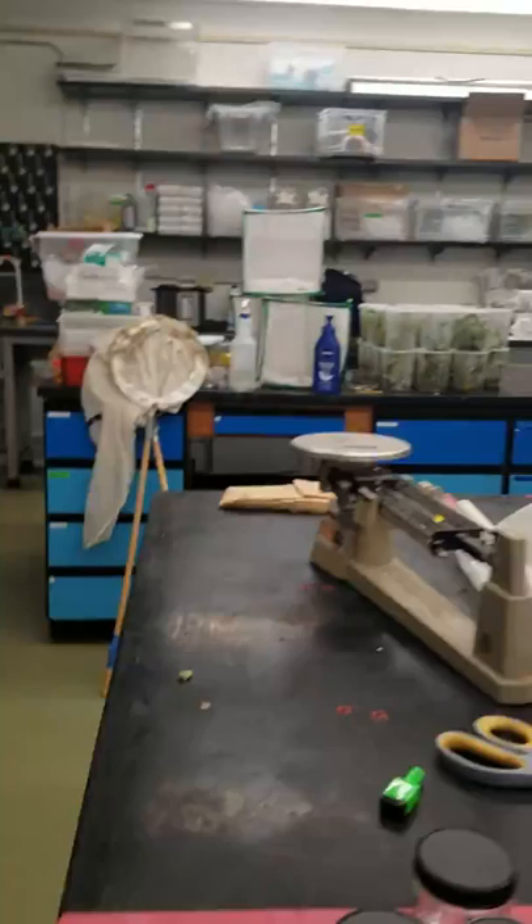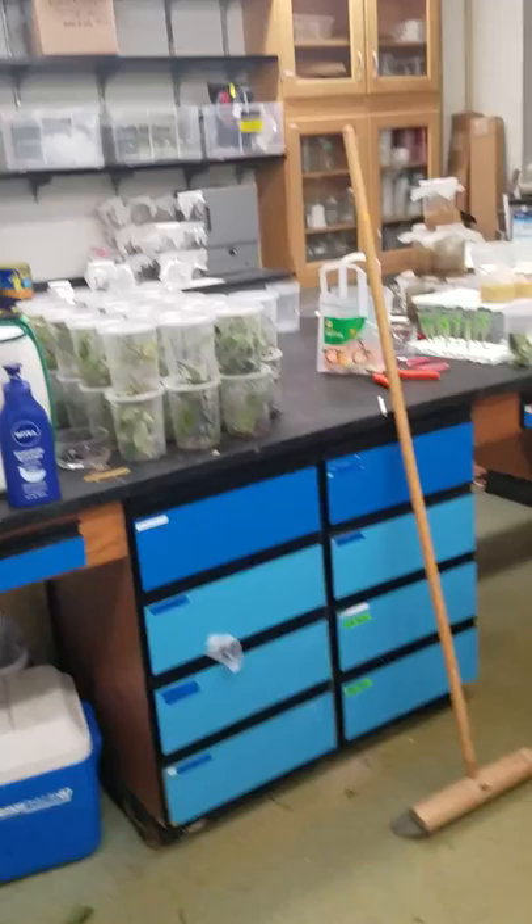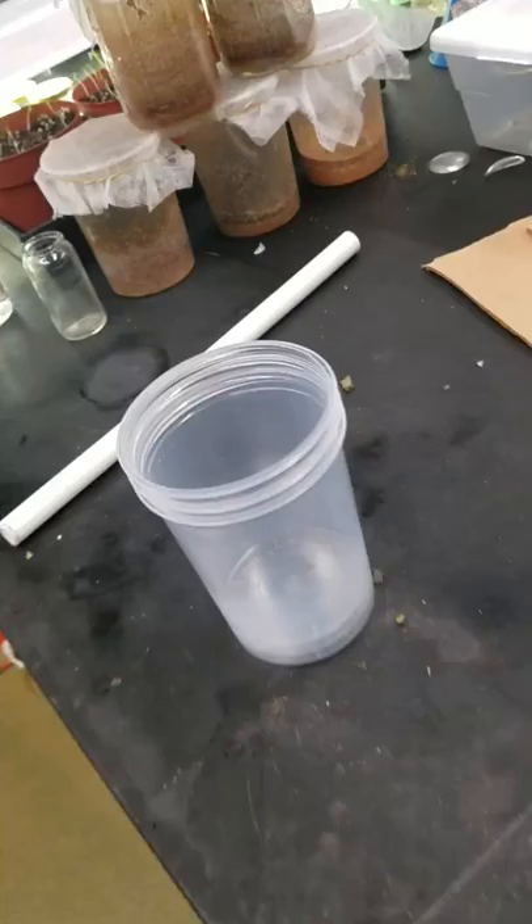Just a quick peek around the lab. I have that bench. I use the light there for some of my plant things. I have some Datana caterpillars developing in there. This isn't really a tour of the lab I work in, but I just wanted people to be aware that I do most of my tissue culture in here, although I will also do it at my house or my cottage or wherever — it kind of just depends on what's going on. You can see I've made a whole bunch of media up over the past couple of days.